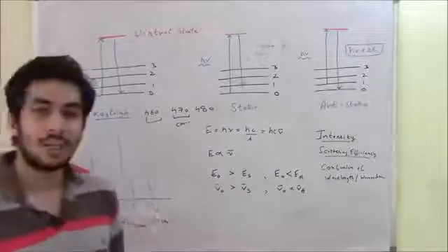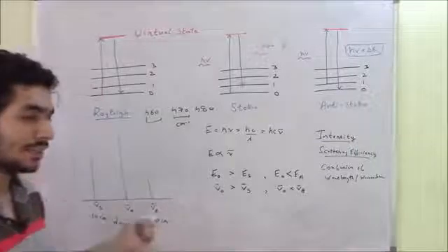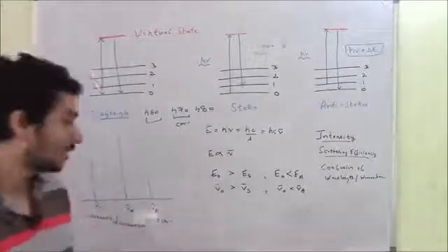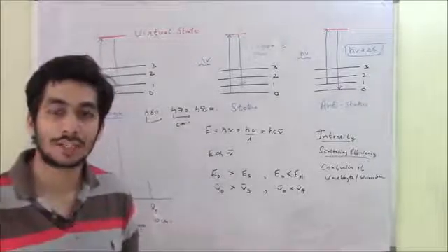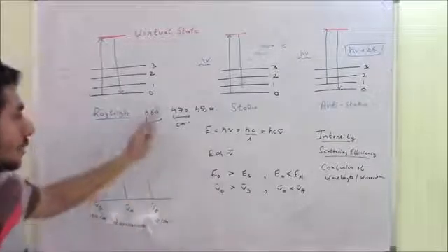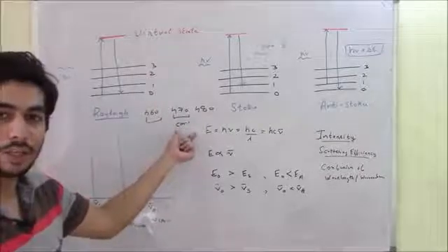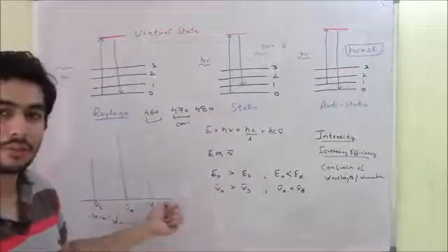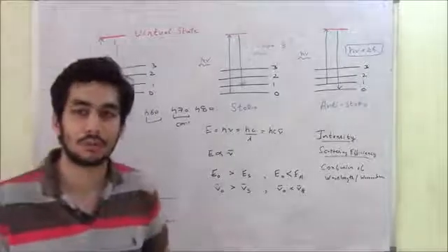That is why, in the Raman spectrometer, you will see minus 10, minus 20, minus 30, like that. So in the Raman spectrometer you see negative and positive signs. Positive signs represent the anti-Stokes line, and negative signs represent the Stokes line. You won't see 460, 470, 480. 470 is the wave number of the Rayleigh photon, which is taken as reference, so if you get a line at 480, it will be shown as 10 centimeter inverse, and if you get it at 460, it will be shown as minus 10 centimeter inverse. This is very important for you to understand.